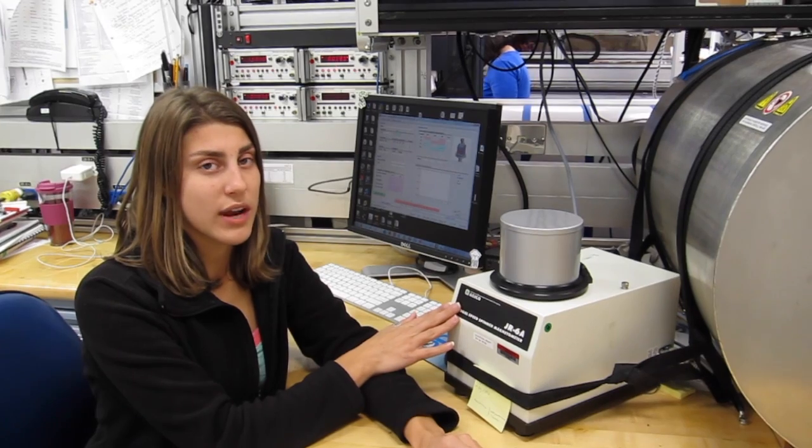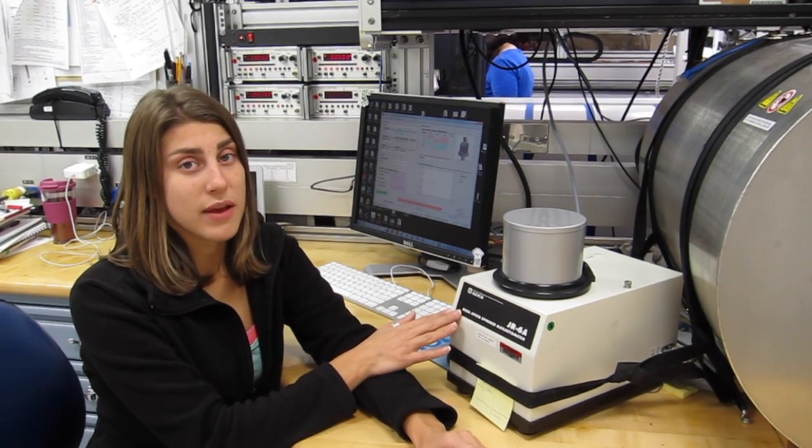We put it in the degausser, which demagnetizes it. We demagnetize it step by step, and then we measure it to see what happens when we remove some of the magnetization.